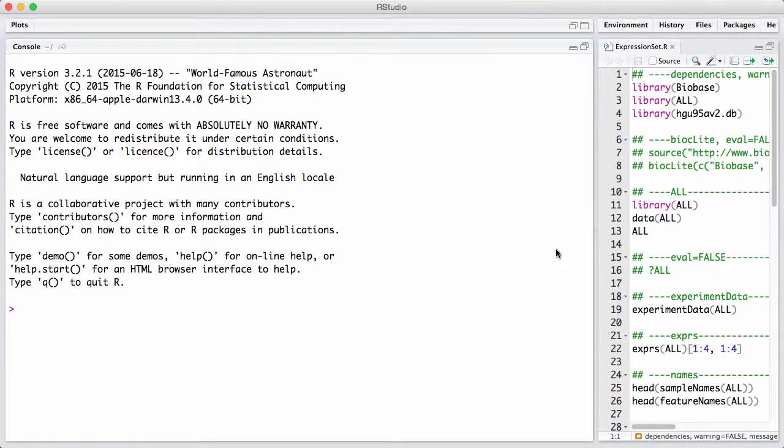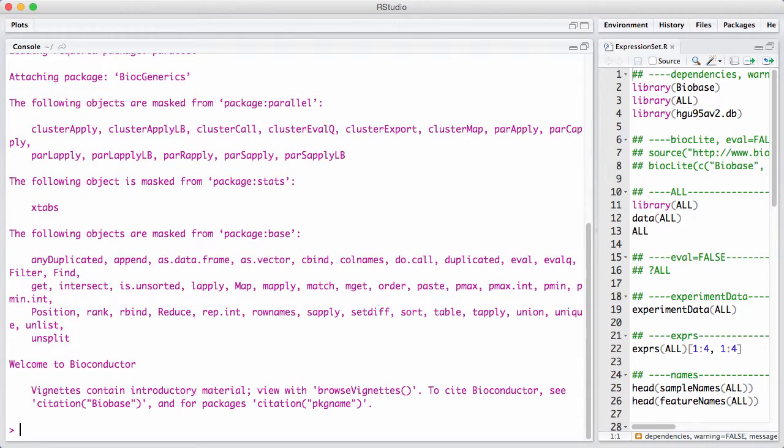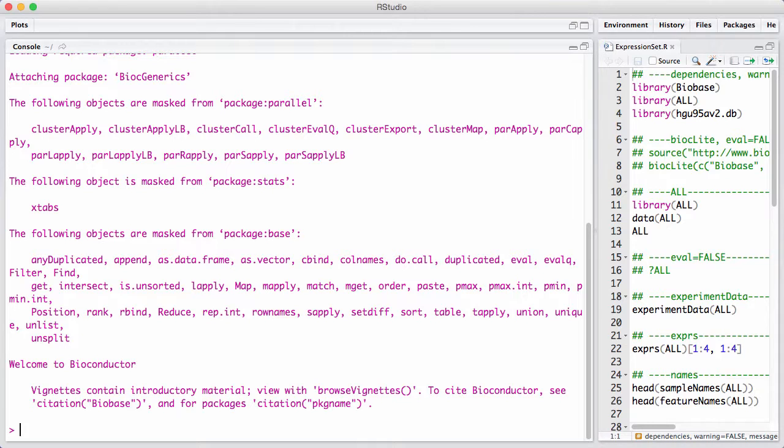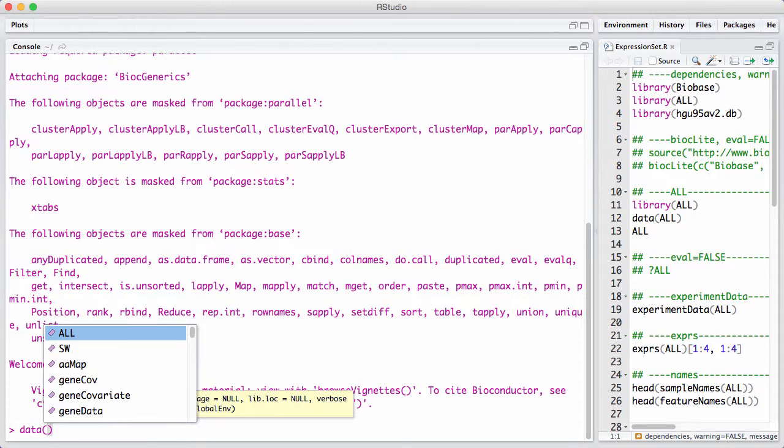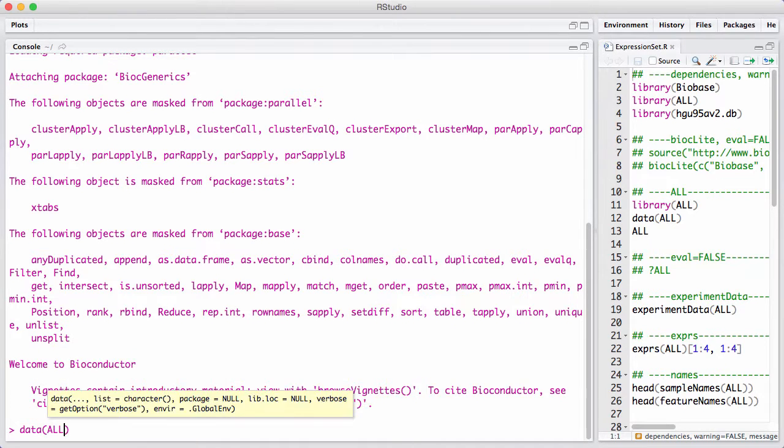As an example data set, we will look at the ALL package, which is a so-called experimental data package from Bioconductor. These types of packages repackage existing data from publications into nice, easy-to-use data sets in R.